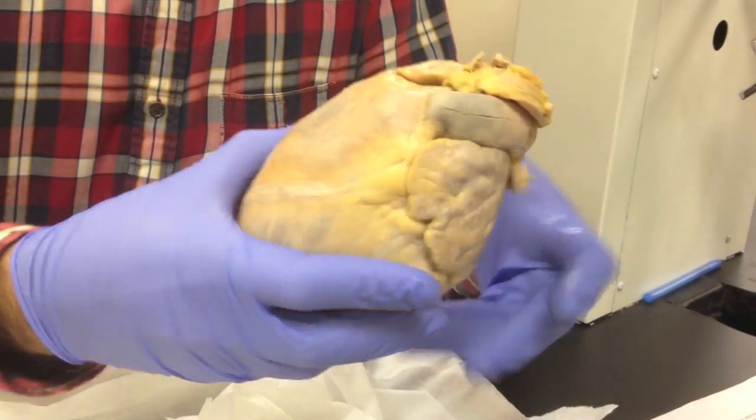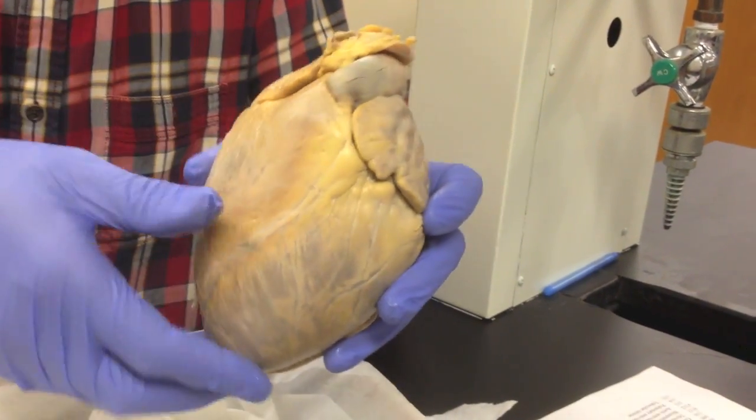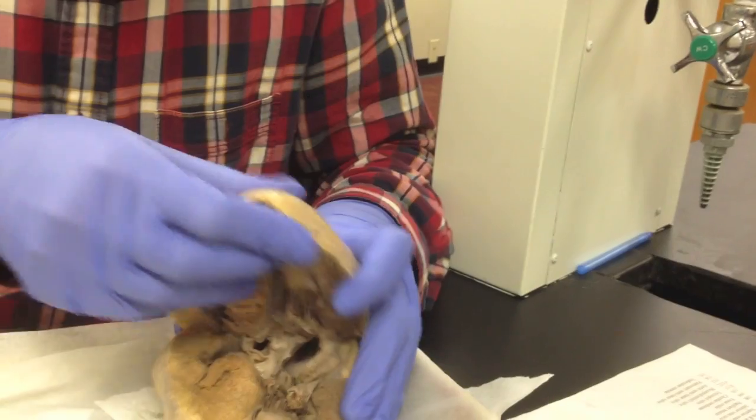So we're gonna go inside the heart now. We did a frontal cut of the heart, and you're gonna divide and see what's inside.